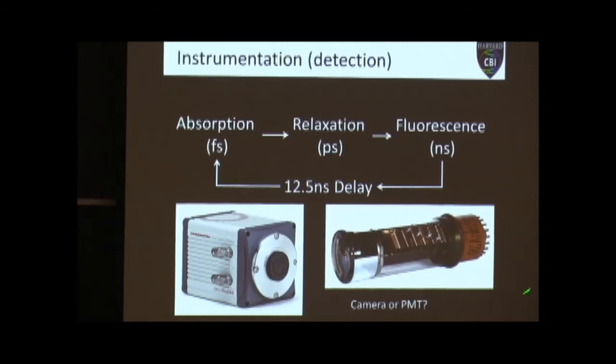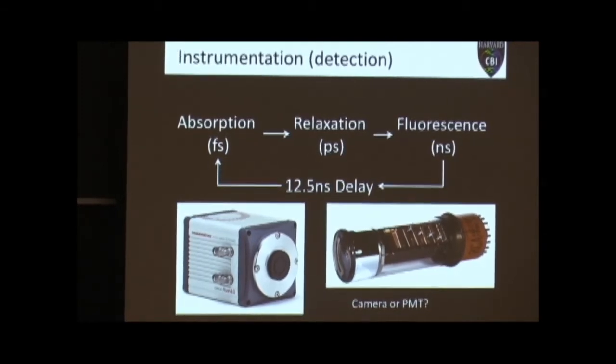So although this takes a second or two to image your entire field of view, you've imaged 4 million pixels in that time. So you've actually taken 4 million different measurements. Whereas this might only take 20, 30 milliseconds, but you've really only made one measurement, right? Just at multiple different speeds.